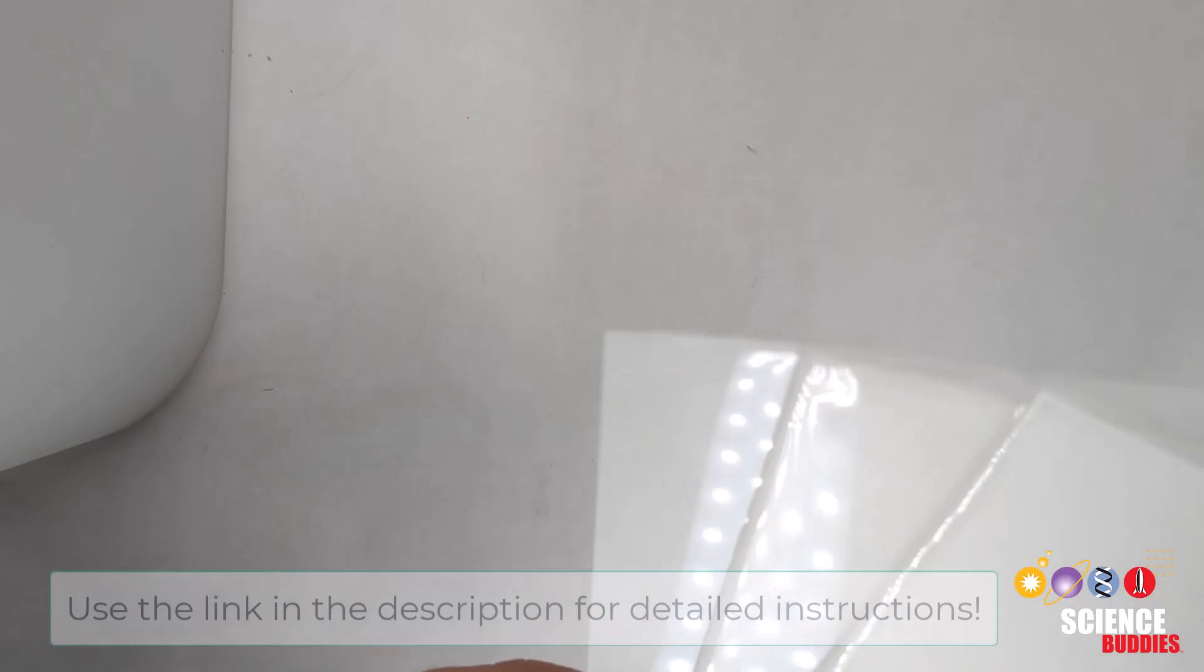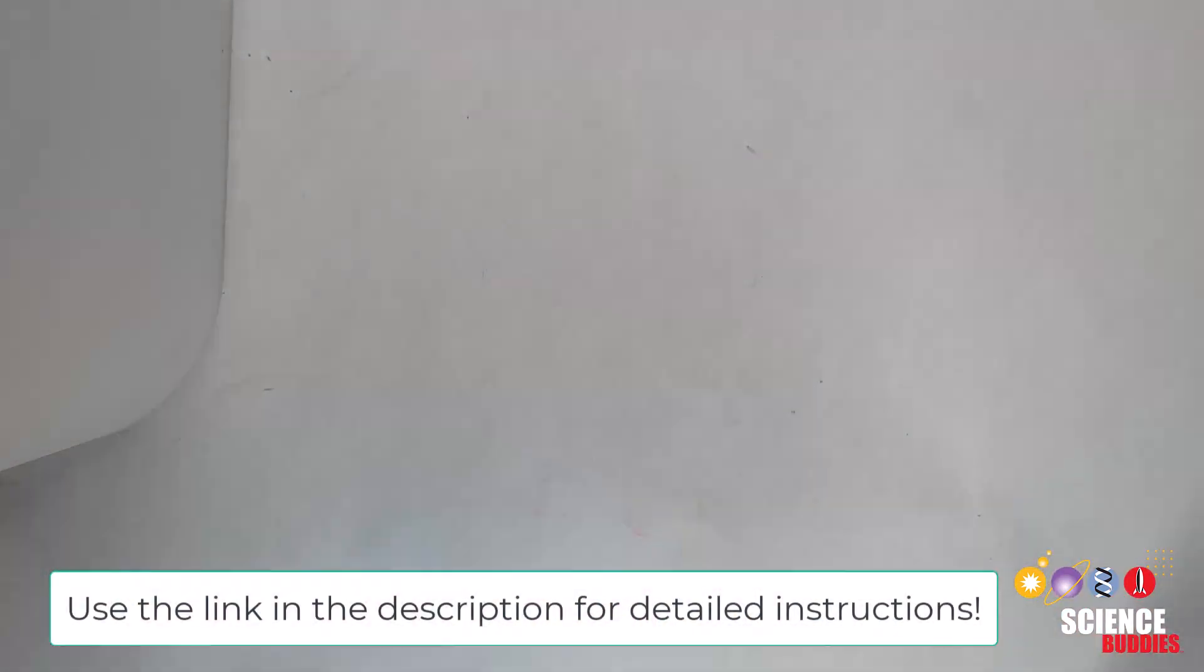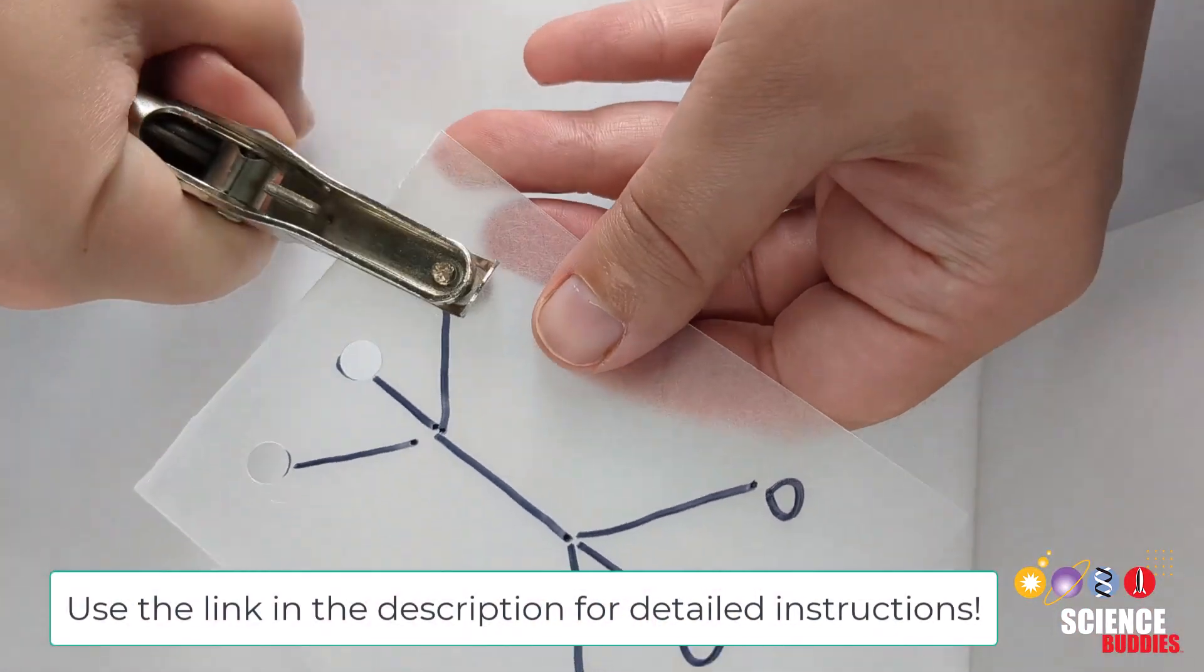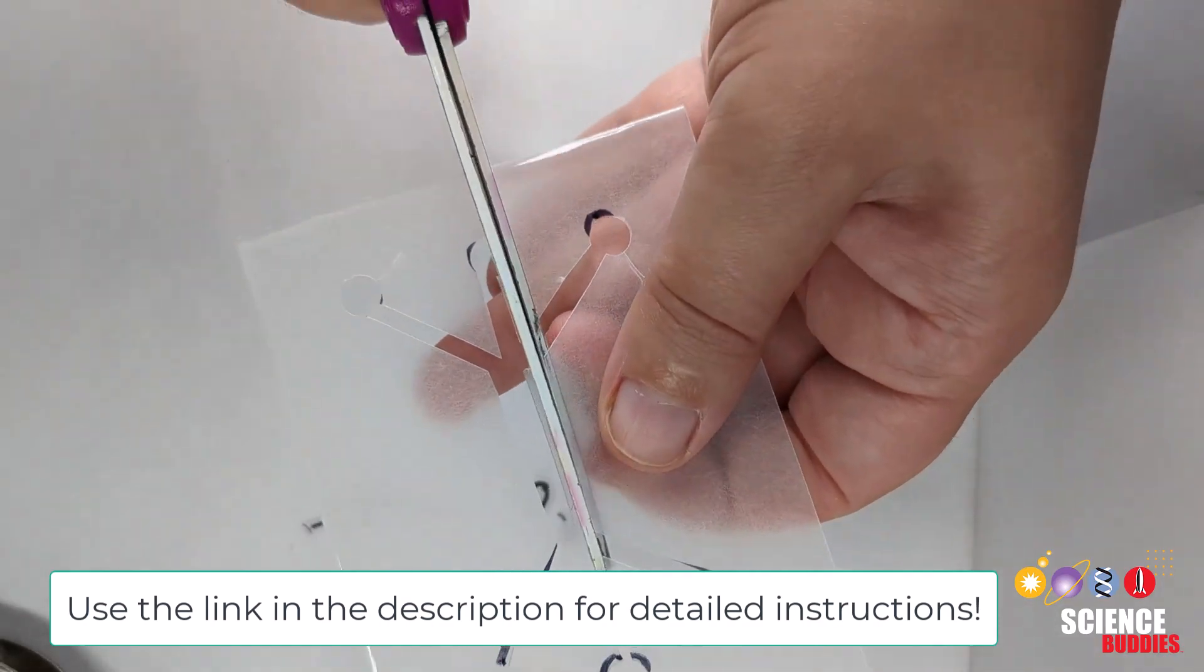First, you will need three similarly sized polystyrene sheets to start your experiment. On the middle sheet, draw your design and cut it out using a hole punch and scissors.